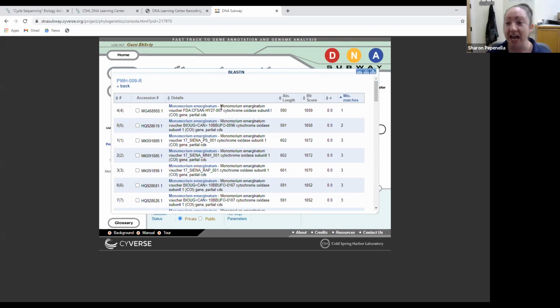So if you have any questions when you're analyzing your data about how similar, or whether or not you have a novel sequence, or if you think the closest match is in fact your species, please do reach out to us when you're doing the analysis, because this is why we have Jeff and Sharon. In addition to us doing the DNA barcode, they will also take a look at your actual samples and do the taxonomic analysis so that we can compare your DNA barcode region to their taxonomic analysis and get the best identification of your ants as possible, okay?